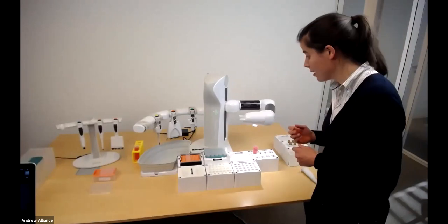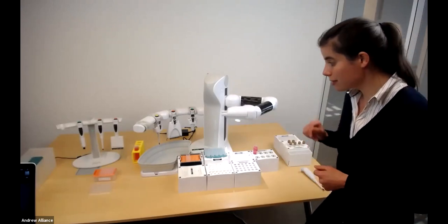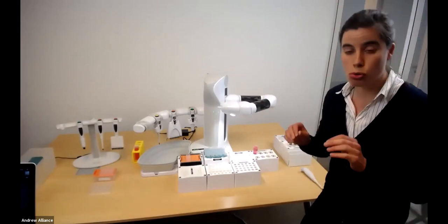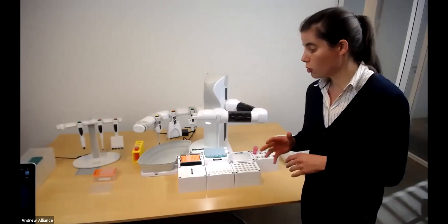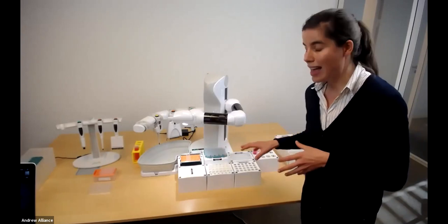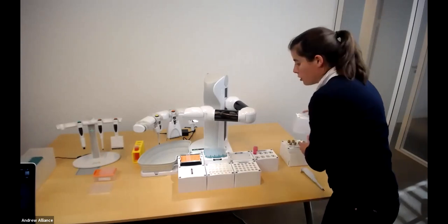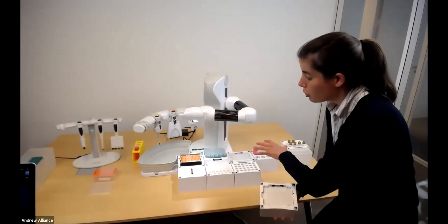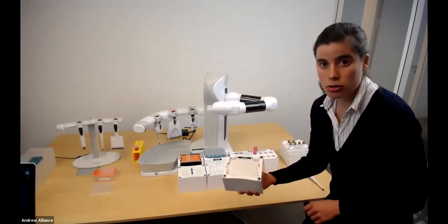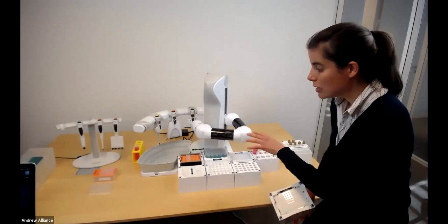What do I mean with that? He has a camera built in. You see the light there under his arm that's moving. And this camera is checking the whole deck around Andrew's body right now. This is crucial because remember, Andrew has to know which tips are there on the deck, how many tips are on the deck, where is my labware, where are my domino blocks. So for example, you see here, there are different blocks around the Andrew Plus robot. We call them dominoes, and they all have different barcodes associated with them. And what that means is this gives Andrew Plus a really good idea of where everything's situated.